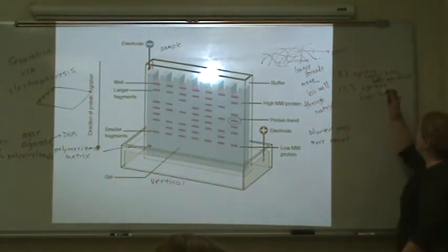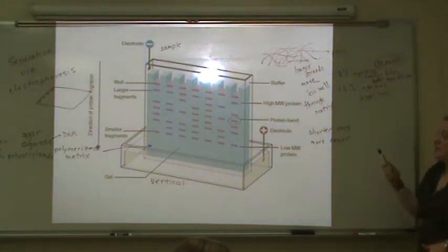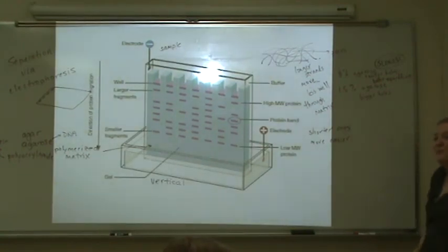But also, the longer it takes or the slower your gel will run because, well, it takes longer for them to move through the gel.